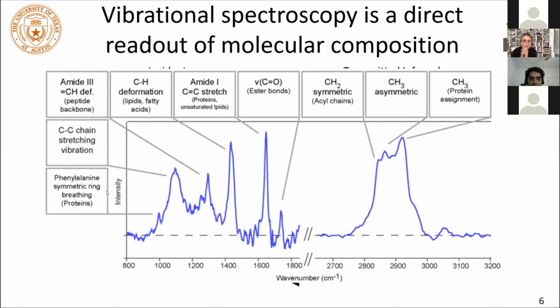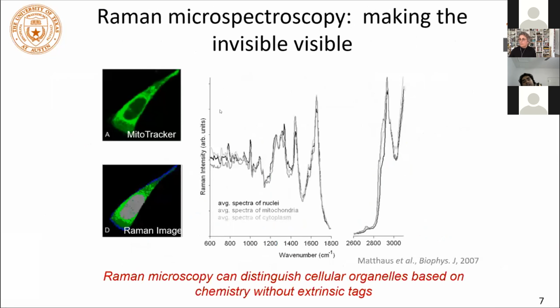Here you've got a bunch of different spectroscopic vibrations, molecular modes. To be perfectly frank, it wasn't people like me that came up with these identifications. That was done over about the last 95 years since the technique was developed, where a lot of chemists sat down, went through the Sigma Aldrich catalog, and did quantum chemical calculations to validate what these different modes are. So this is tabulated almost like a library that you can use to identify different molecules by seeing a spectrum like this, very similar to NMR in that sense. And so what can you do with that? You can now map things.